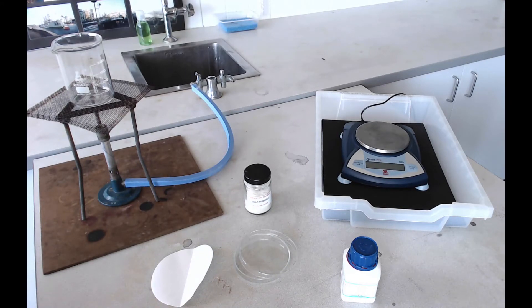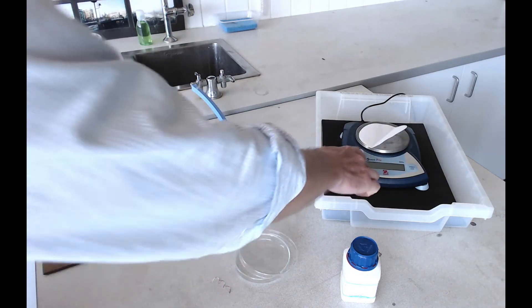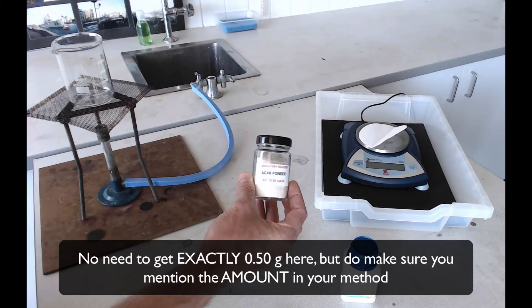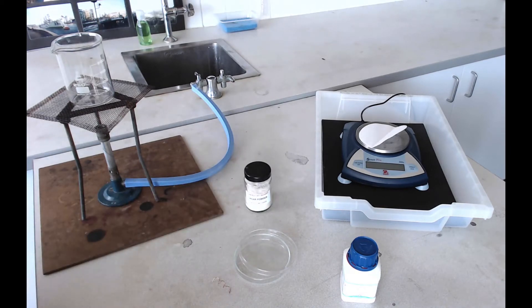The first thing we need to do is put our filter paper on the balance, zero the balance, and weigh out half a gram of agar powder. Be careful with that — try not to spill it around the balance because the balances don't like having solids spilt on them, but if you do just clear it up.